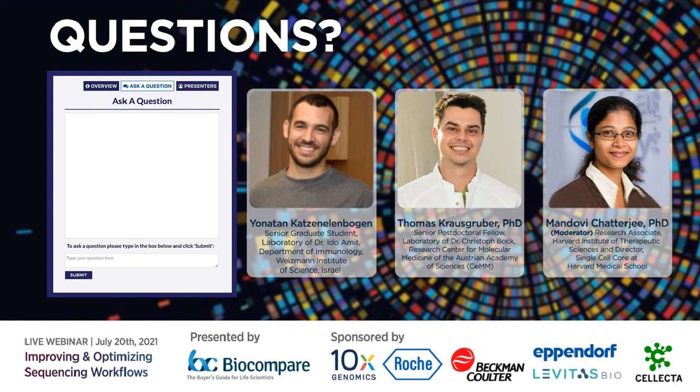All right. We have a couple of questions here. Any input on library prep, Thomas? I think when it comes to library prep, most of the experiment has already been done. If you do RNA sequencing, you have already reverse transcribed and amplified.